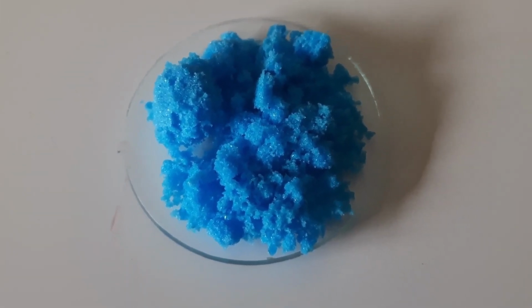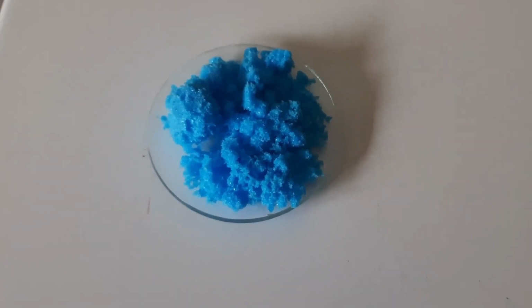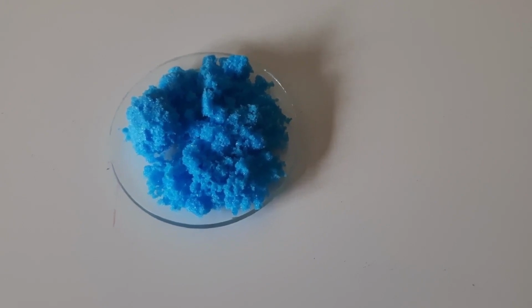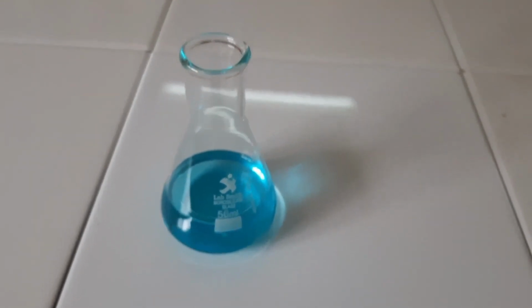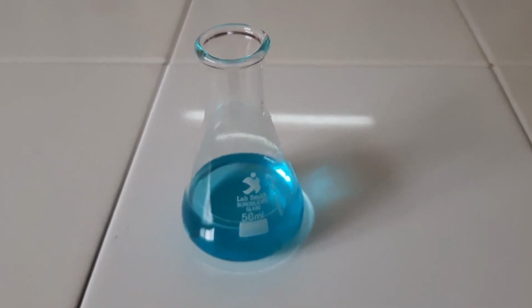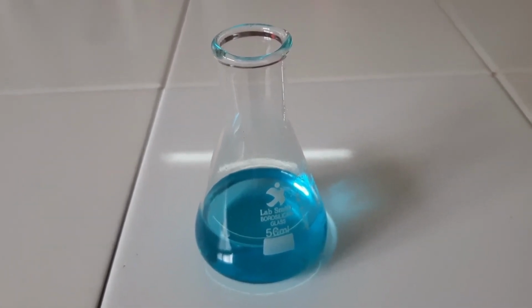This is solid copper sulfate. You can dissolve this solid copper sulfate to make a solution like this. It is pale blue in color. This pale blue solution contains Cu2+ ions. So Cu2+ ions are pale blue in color in aqueous solution.